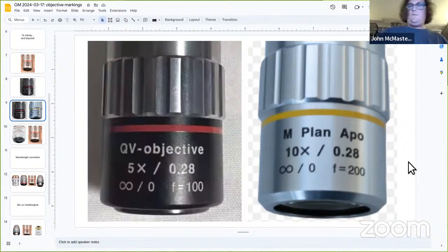But anyways, what starts happening then is you get what people call empty magnification. And the idea is that, if you have a signal and you kind of think of it like amplifying noise, you can always insert more eyepieces that magnify the field bigger.